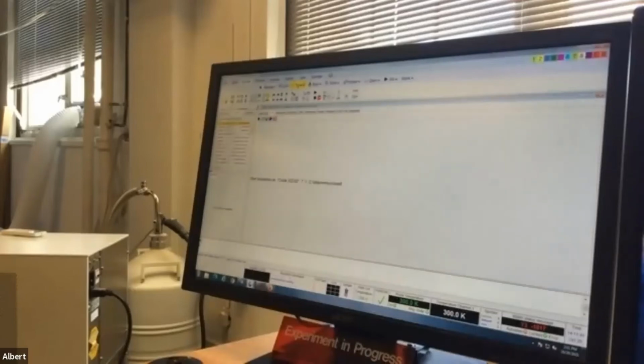All right, so tuned up. Now just put spin and RO on. What is the RO on? Or rotation. Rotation, okay. So if it's spinning, rotation, what was that? That's a rotation on and off.